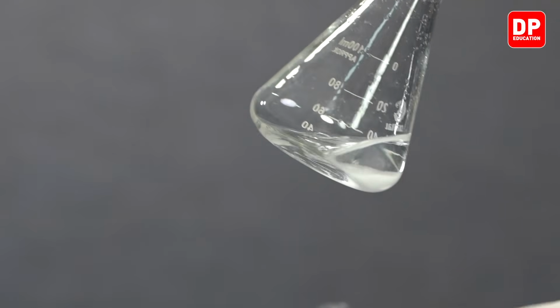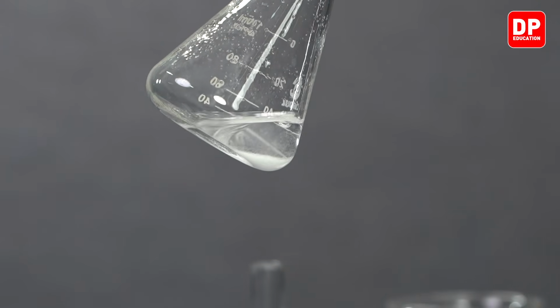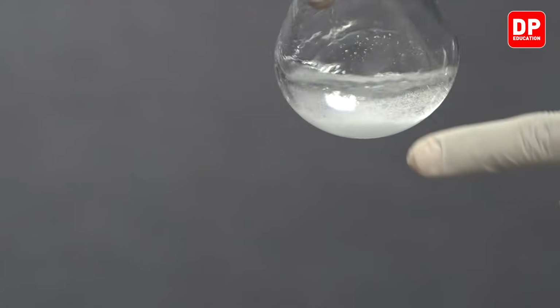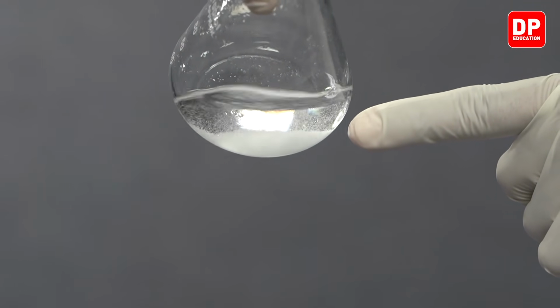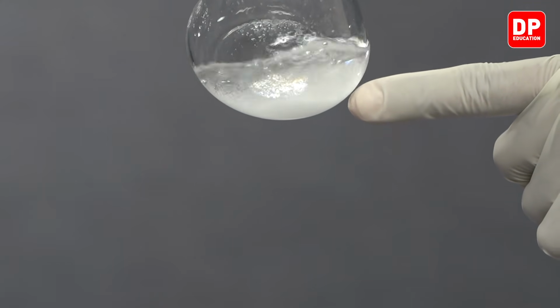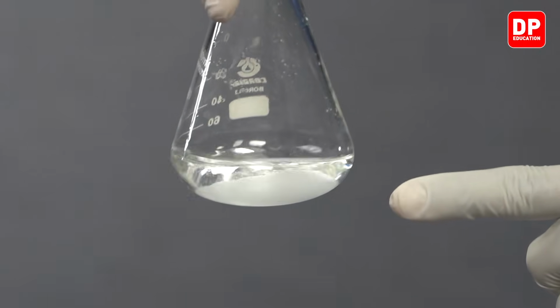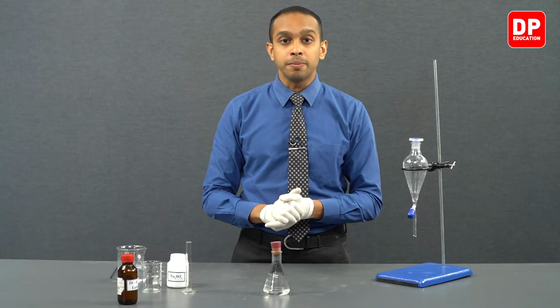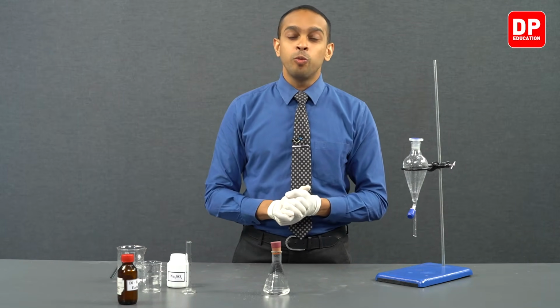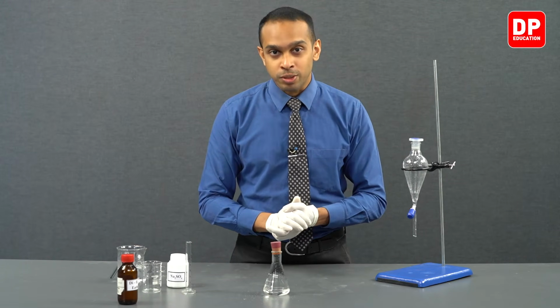You can see all of the sodium sulfate is dispersed and they are not clumping together. As you can see here students, the sodium sulfate is not clumping together when swirled. This indicates that there are no traces of water additionally found in this diethyl ether layer. Now we can move on to the next step of this process.